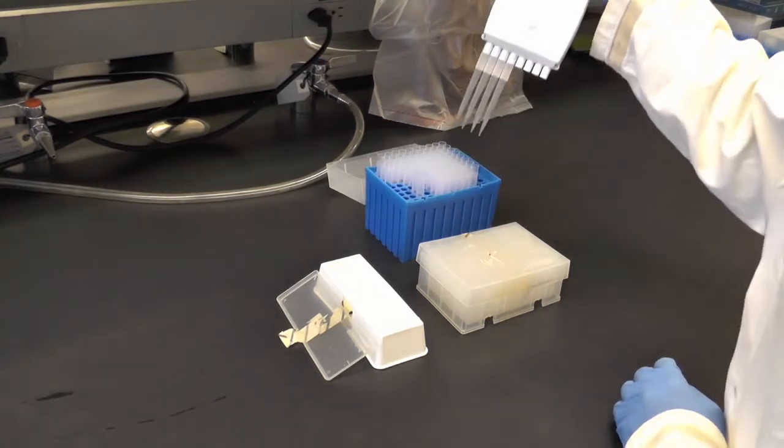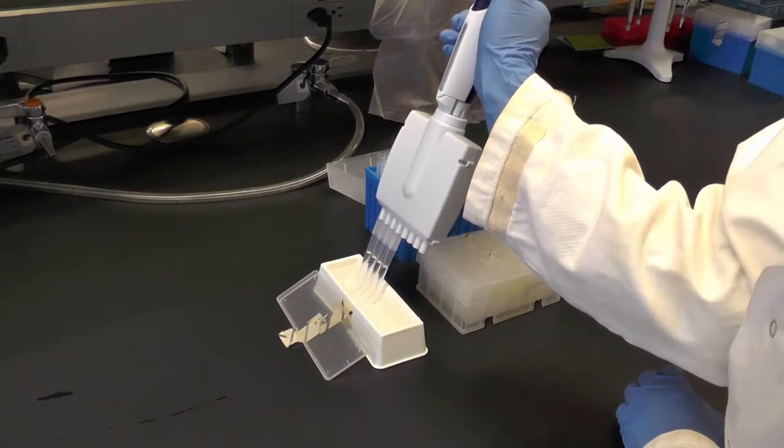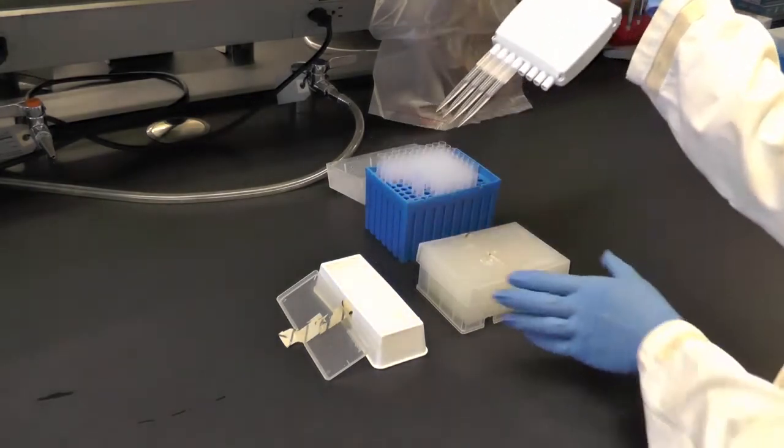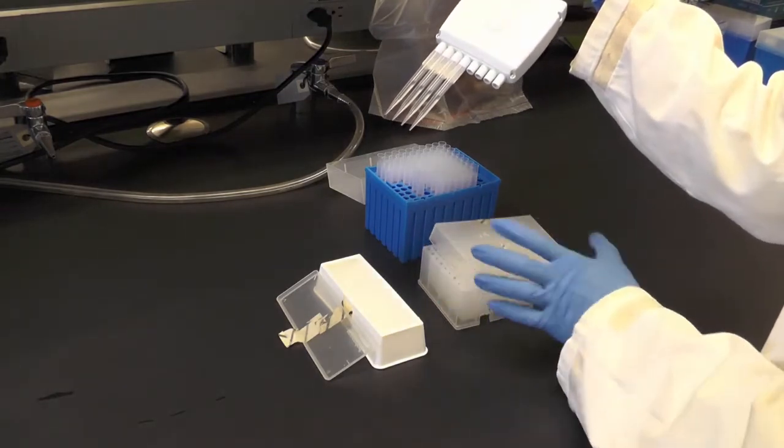In this example, we are using a diluent volume of 450 microliters. Insert the tips into the liquid in the reservoir and draw up. Ensure that all tips draw up the same amount.